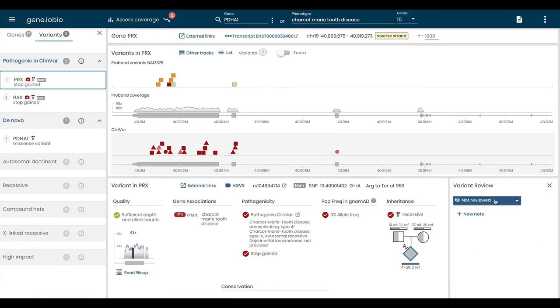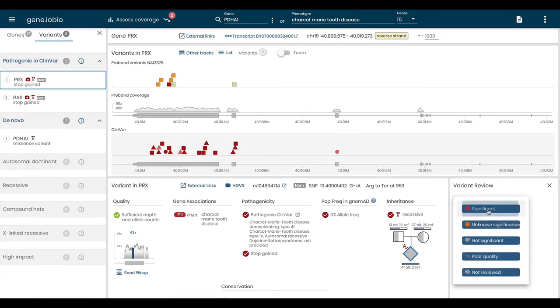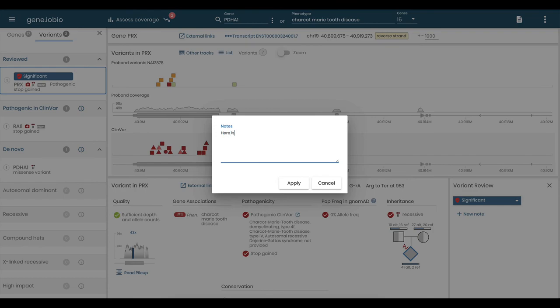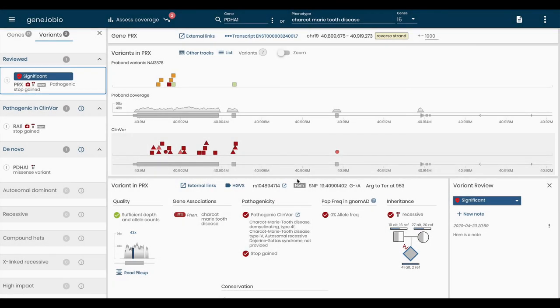To see all of the available features, including on-demand variant calling, take a look at our blog posts at the iobio homepage.